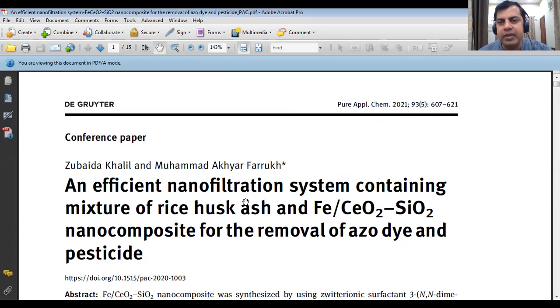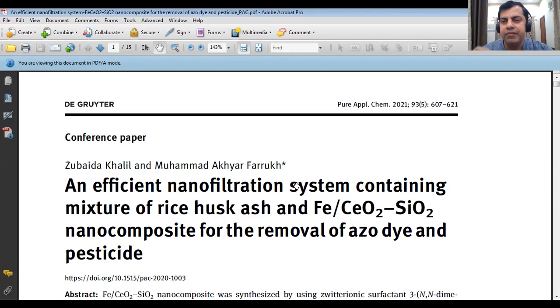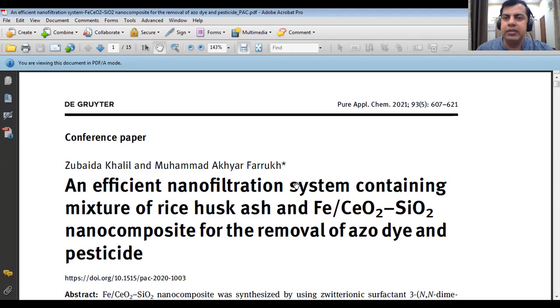In conclusion, I have shown you three ways to calculate the band gap. This is a very simple technique you can use to calculate the band gap of your nanomaterial, determine optical properties, and link the band gap with the particle size to show whether your material exhibits a red shift or a blue shift.